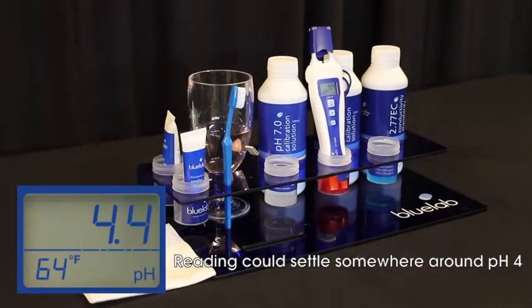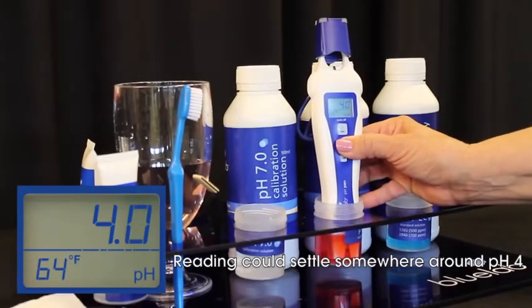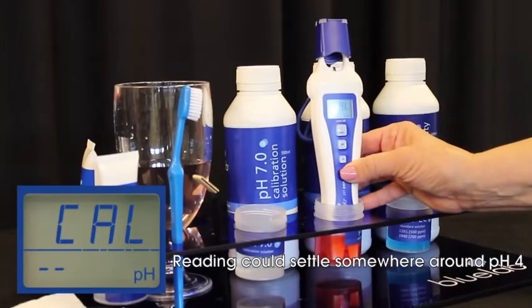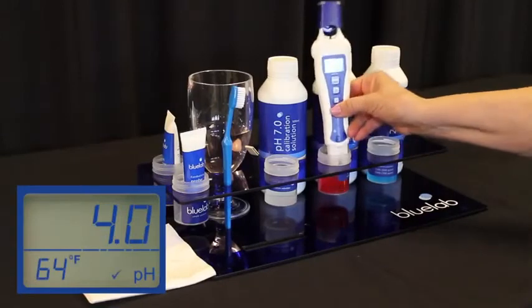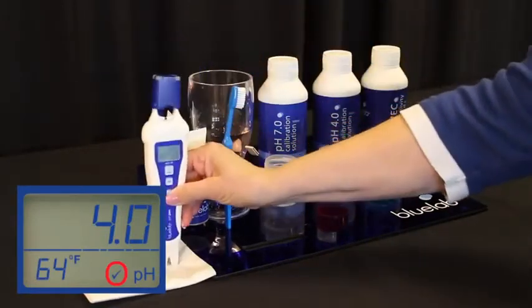You may get an error message if you press too early. Once the reading has stopped moving, with the pen in the 4.0 solution, hold the cal button down until the display reads CAL. Release the button and wait till it reads 4.0. A check mark will appear on your screen to tell you your calibration has been successful.